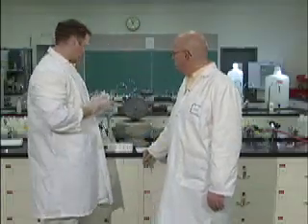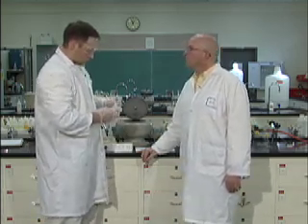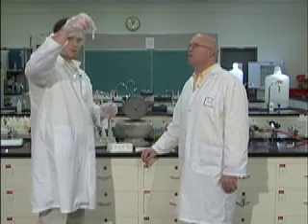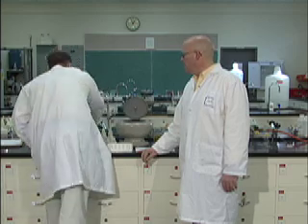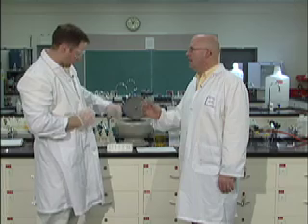So once we've discovered that we have silver in there, we write that one down, and we can discard this one here. That was the precipitate. But we still have that other one, full of cations, definitely.